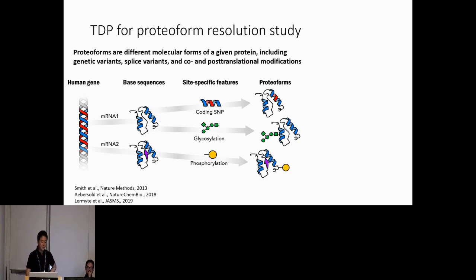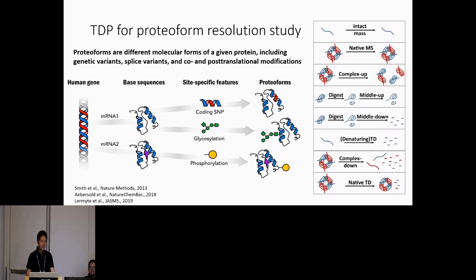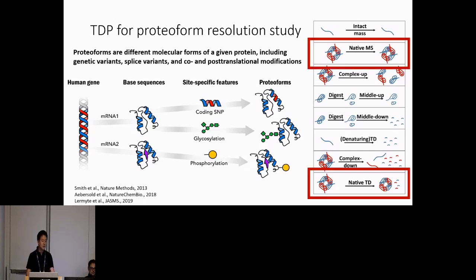So top-down fits well for proteoform level studies. And these days there are a bunch of different protocols, as you see on the right side. But now the tool is more or less focused on native MS, or native top-down, or complex-down, which is quite similar to native top-down.